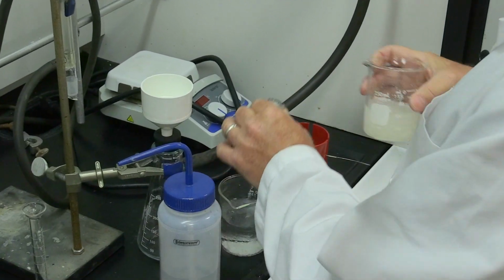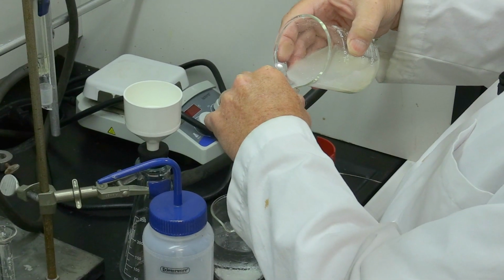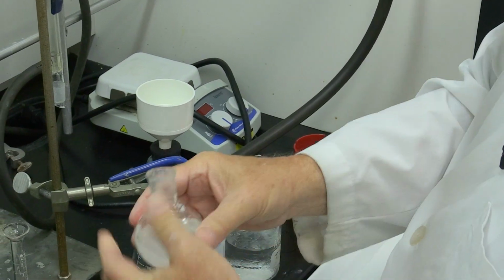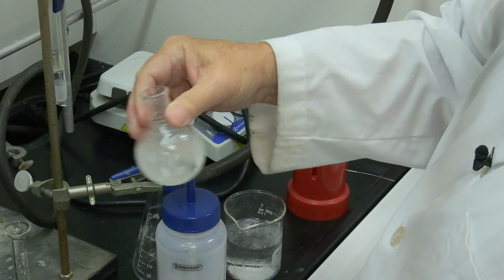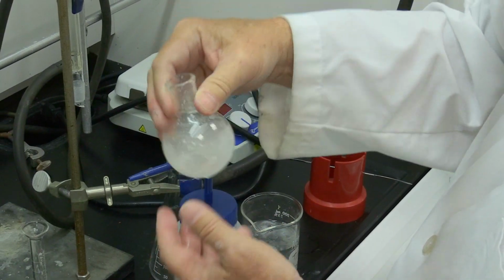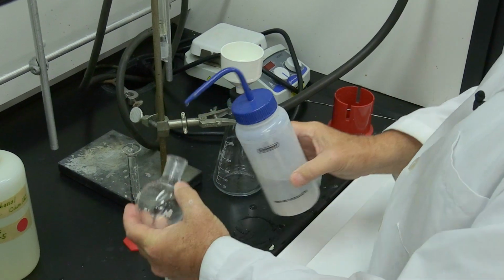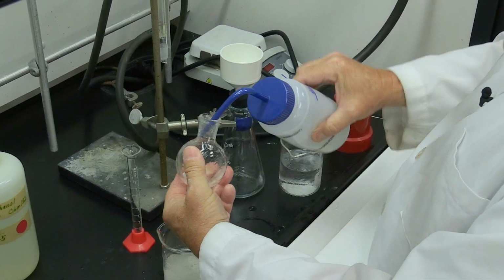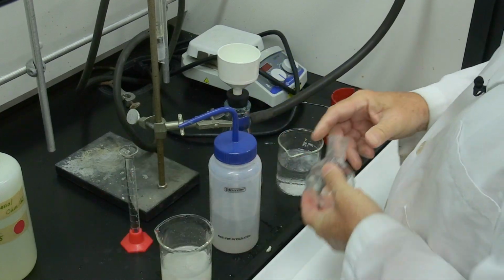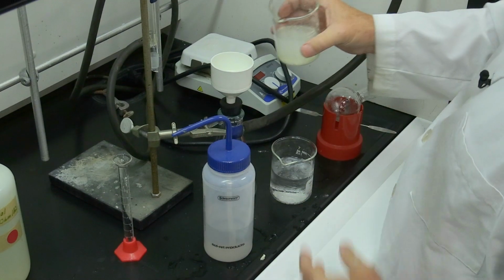And we're going to actually try to get some more of this out before we transfer it. There we go. That's what we wanted to do. That's good. Now we can transfer it to our funnel.